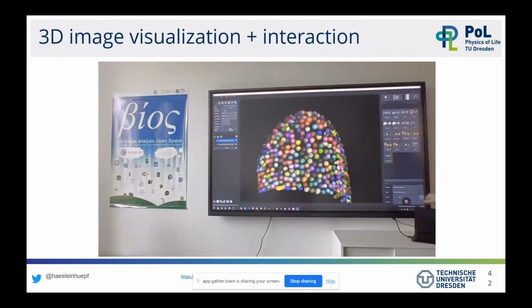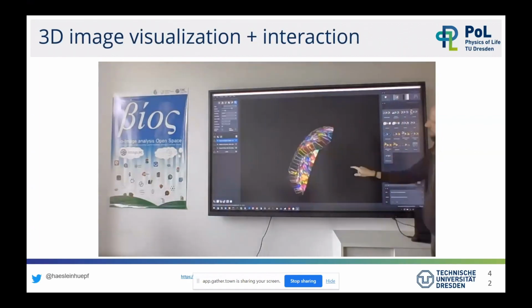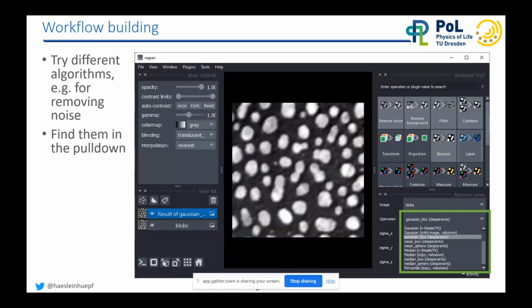Yeah. And if you wonder why are the buttons so big, the buttons are so big so that you can use this tool from a touchscreen. Like, for example, I'm using it here on the big touchscreen in our former office. So yeah, interacting with 3D image data on the big touchscreen is also fun. I can recommend. Good. So this is basically what you do.